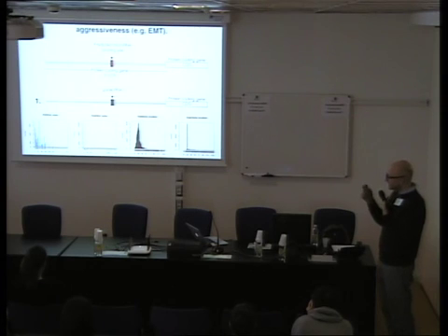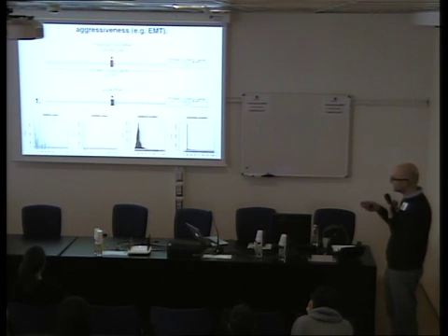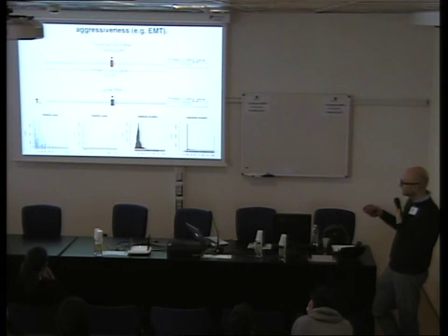And since in our department they are now running quite few MiSeq experiments, we just used the machine to run our clones. So this is if you do a targeted sequencing of this region, and then there is an online software that gives you this analysis, exactly for CRISPR.